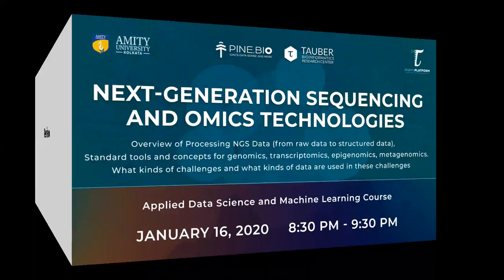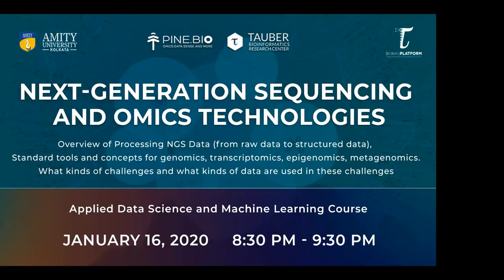In the last meeting, when we all met, we discussed the data generation techniques and how NGS data is processed. We discussed the data-driven hypothesis or discovery and how transcriptomics or RNA-seq data is generated, processed, and aligned.